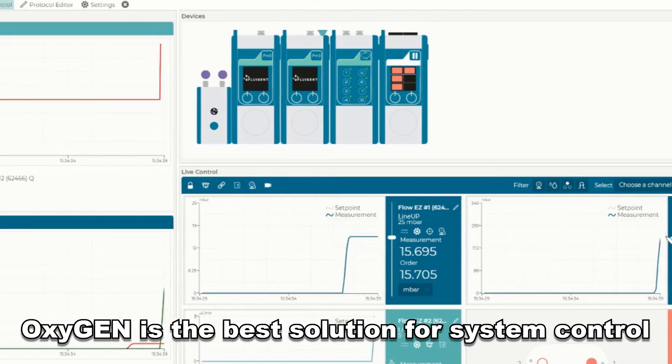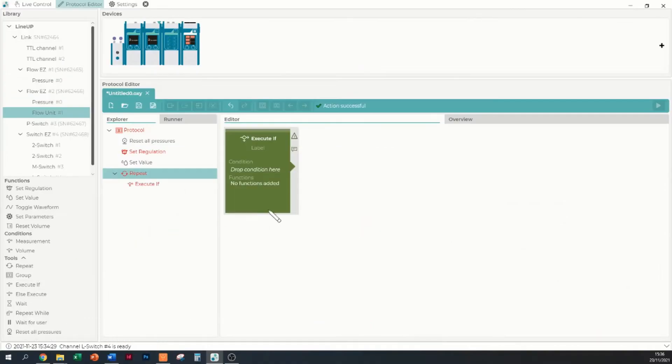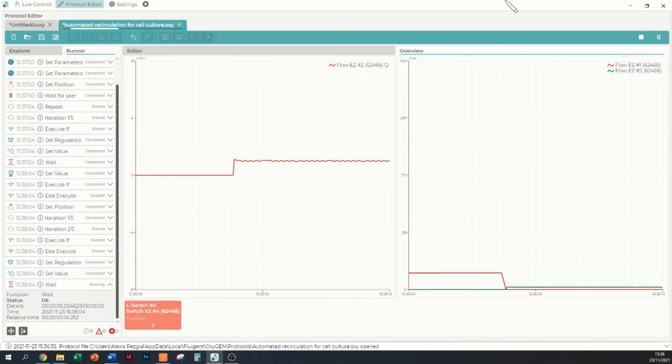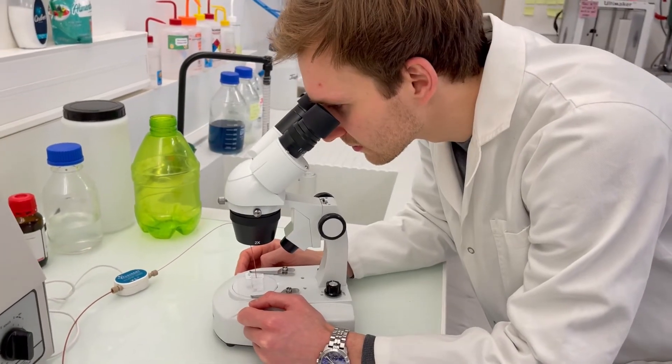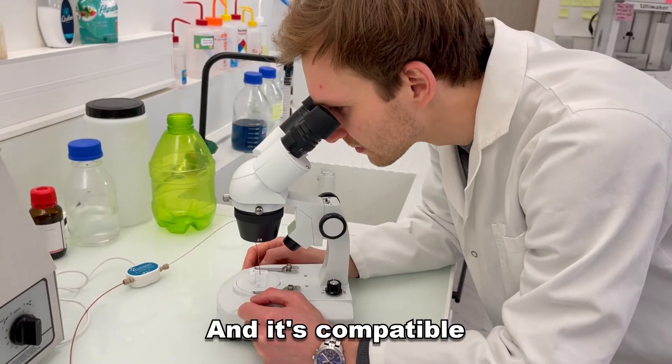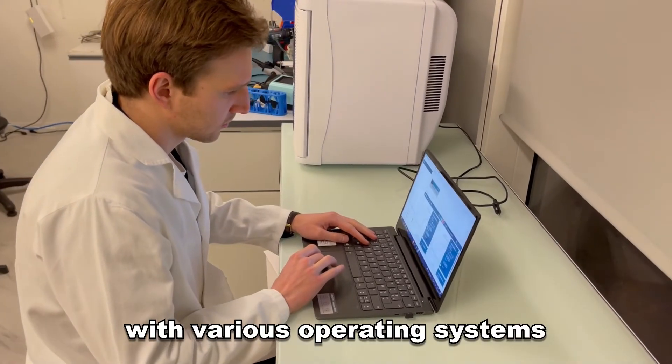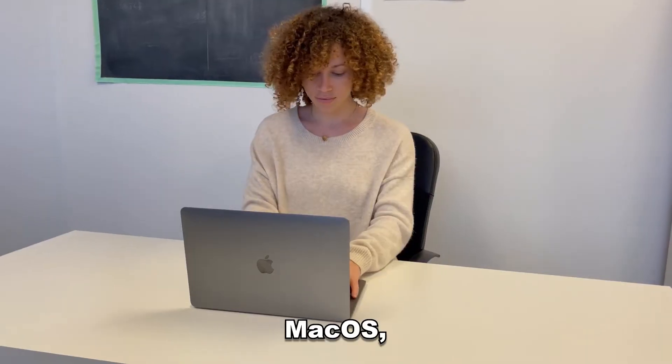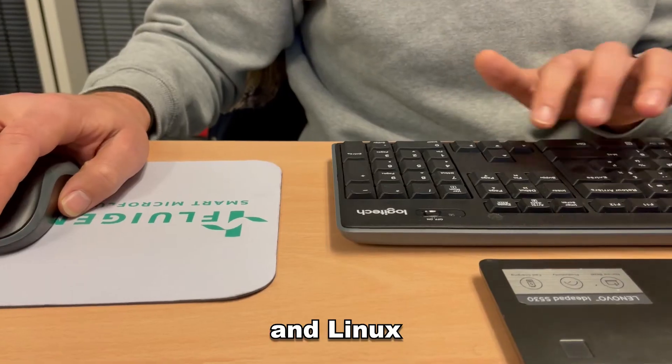Oxygen is the best solution for system control and collecting relevant data, and it's compatible with various operating systems including Windows, Mac OS, and Linux.